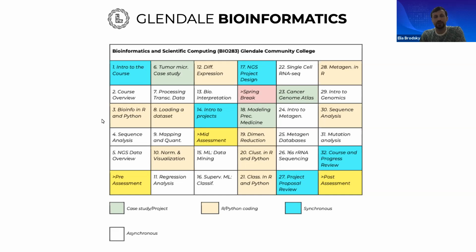So in the case of the different types of applications of methods, there are going to be universal methods like mapping, alignment, normalization, etc. And there are going to be also specific methods, like a method for finding specific variants, like variant calling for genomic data, or methods for evaluating alternative splicing, which would be more relevant to mRNA because that goes through alternative splicing.